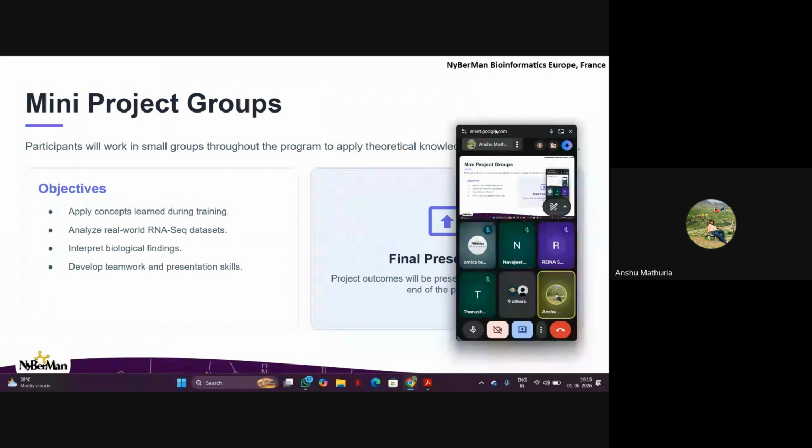So that is the basic understanding of the entire RNA-seq workflow. Whatever steps we have learned now from the start till the end, we'll be analyzing them separately, individually, as we move on to the further sessions, and we'll be performing all of them hands-on.